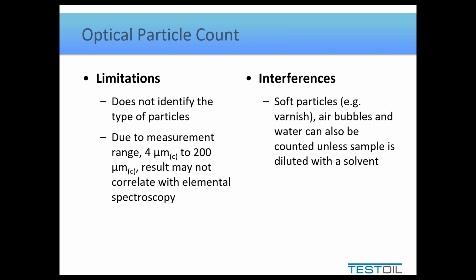So this might help some of you who have ever done an on-site or online particle count understand why it's always so much higher than what the lab gets. Labs typically go through all these steps to prepare the samples, but portable and online versions do not. So that's one way of doing the particle count.